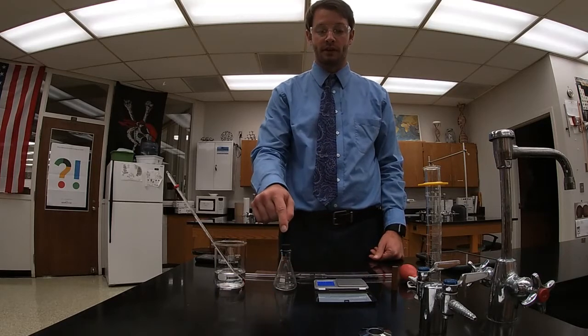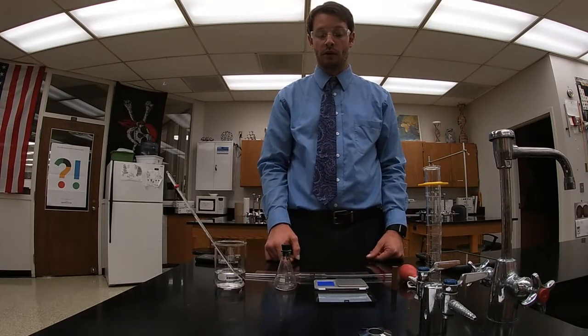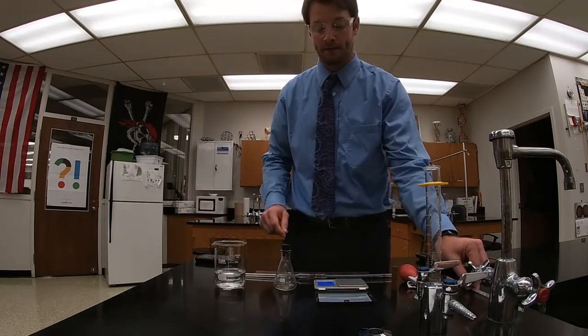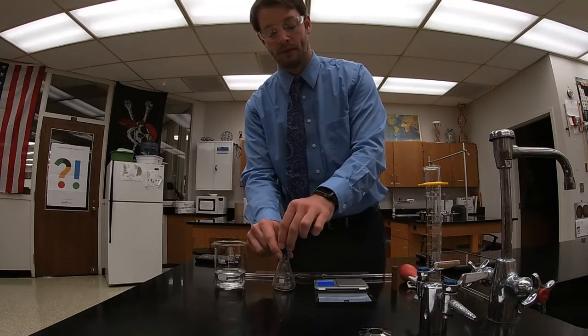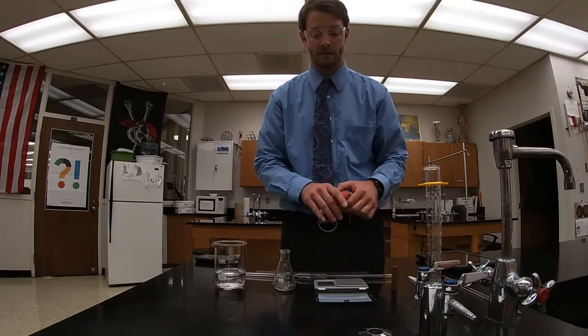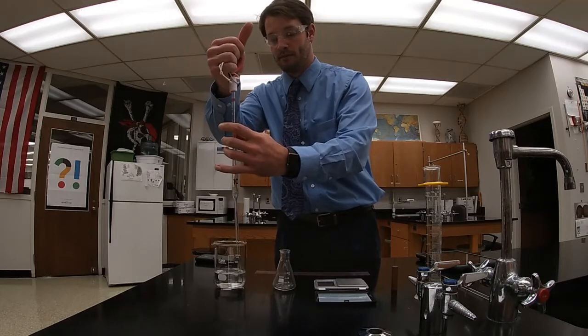We already have the starting mass for our Erlenmeyer flask, so now we want to start adding water to it. Set the thermometer aside, and we want to pipette four 10 milliliter portions of water to the flask. So I have the mass of my empty flask. Now I'm going to pipette 10 milliliters of water.